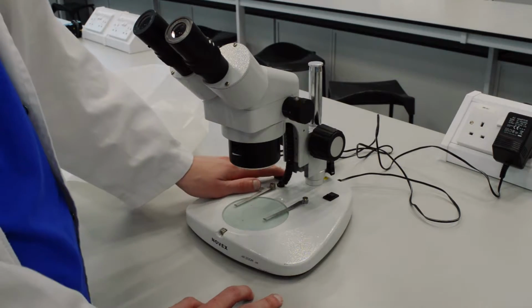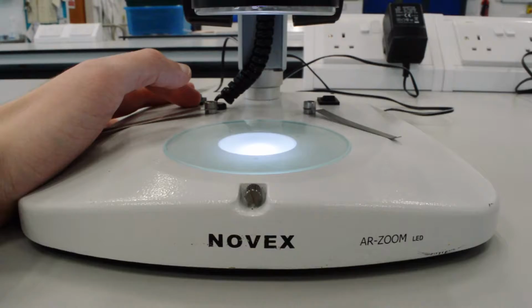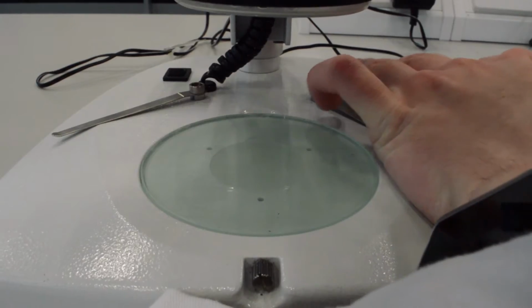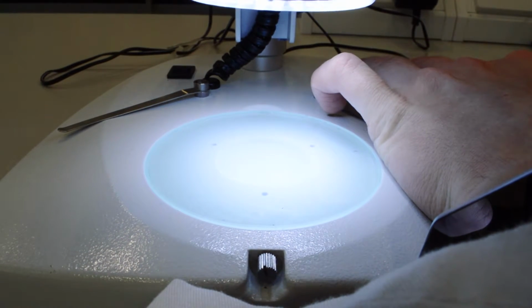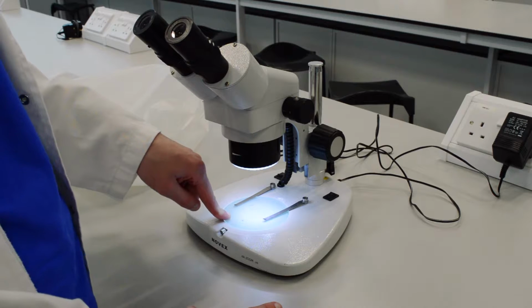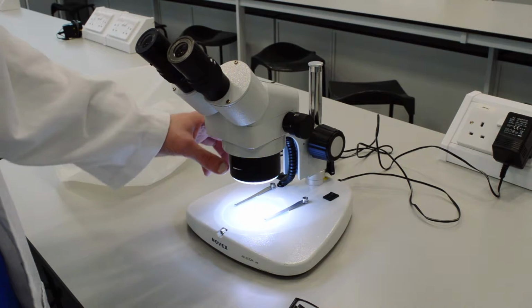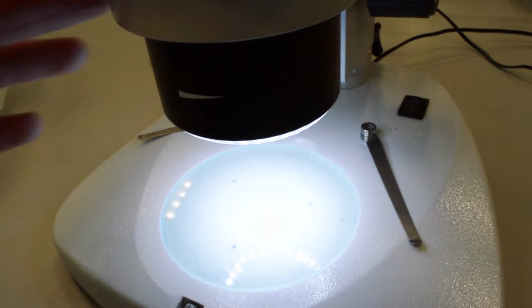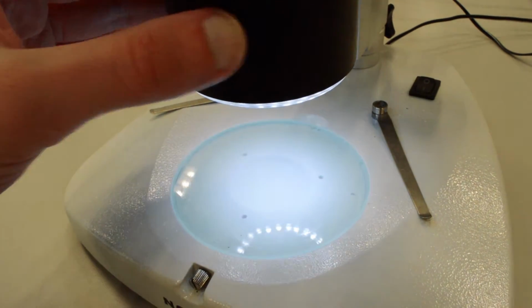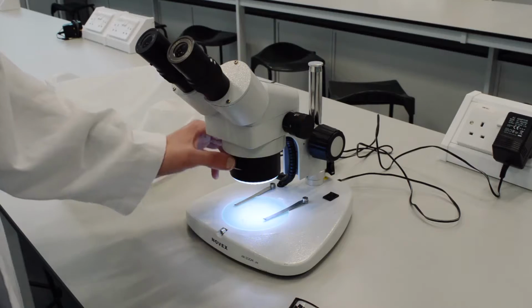And at the back you have two lights. One controls a light on the stage that goes up through your organism, and the other comes down from the lens of the microscope so that you can see it onto the organism. In addition to the light, you have a toggle here which allows you to control the amount of light that will pass through onto the organism. You either have more light or less light, obviously.